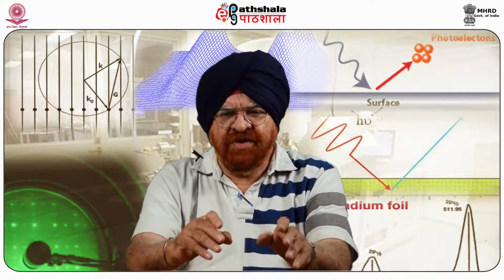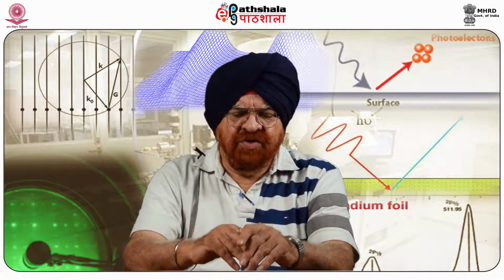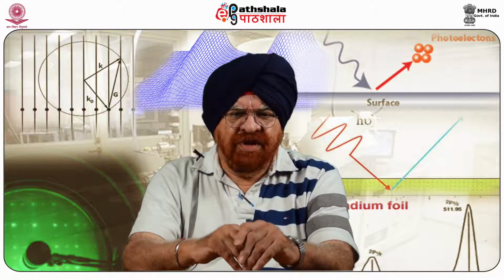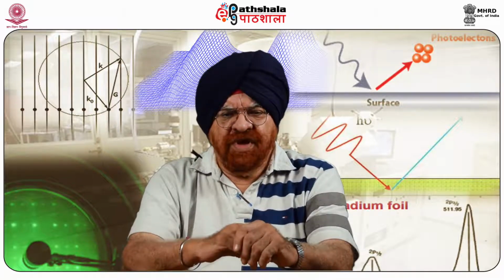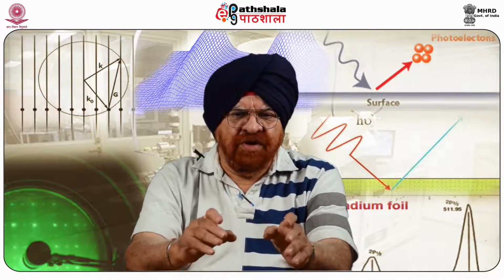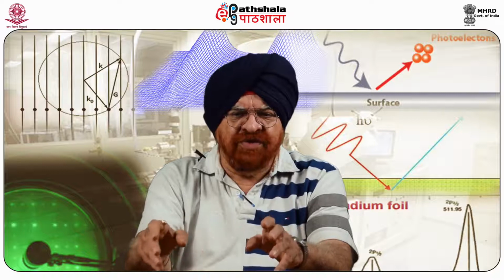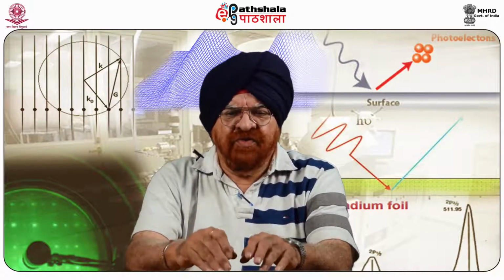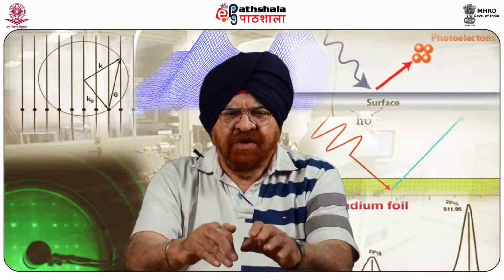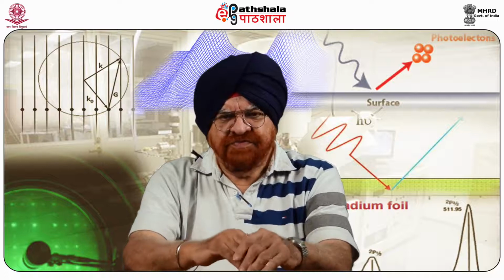The work function is the minimum energy or work, usually measured in electron volts, needed to remove an electron from a solid to a point immediately outside the solid surface, or the energy needed to move an electron from the Fermi level into the vacuum.